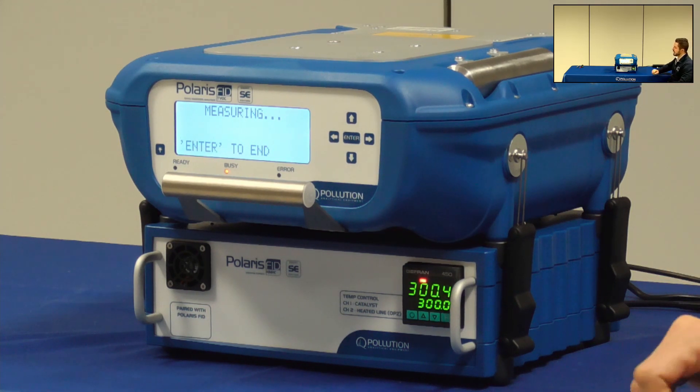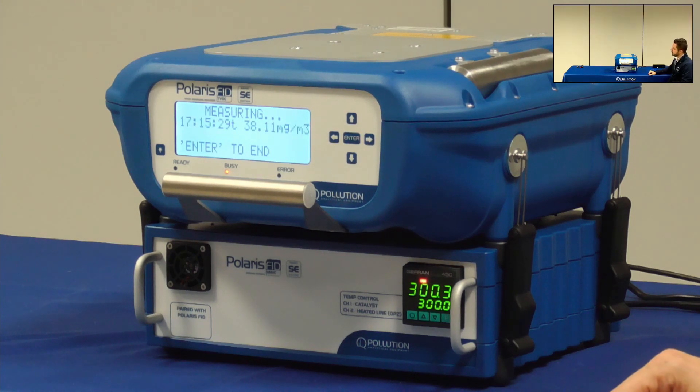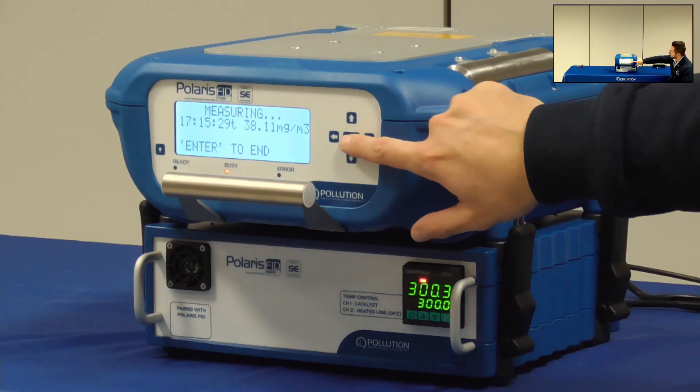By pressing Enter you will stop the measurement at any time and go back to the method menu and perform the calibration.